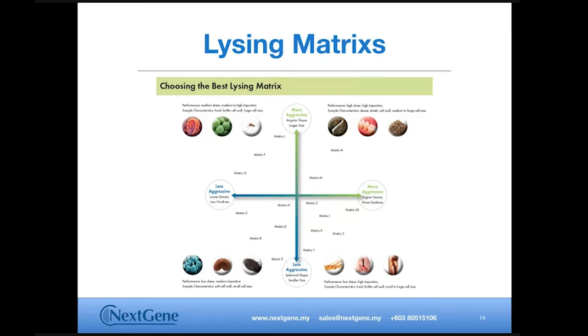However, designing the primers, because sometimes, Prof, here the problem is unknown viruses, so that's why it's a bit hard to design the primer. And currently we don't have much info about a universal primer for viruses. So I would say for now, one of the ways we can do is to try to enrich the virus in the sample first, using maybe centrifugation or even a filtration method. And then if we go for the sequencing, then we hope for the best.